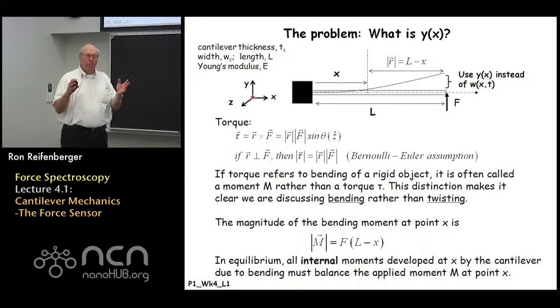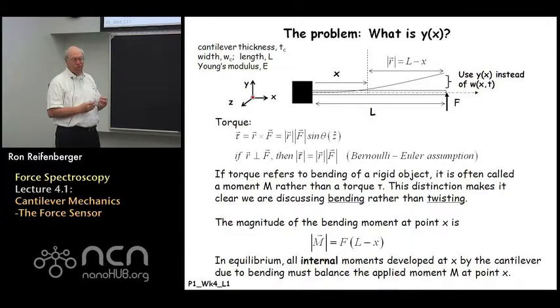And what you must realize, of course, if you've had your introductory survey course in physics, is that in equilibrium there's no motion of the beam. It's just bent, deflected in some way. The sum of the moments acting on any part of the beam has to be zero, or otherwise the beam would undergo further distortion.